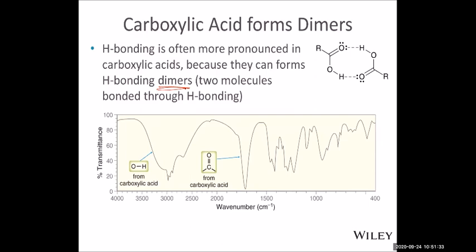And then still around 3000, we look at the other CH bond. Because the carbon is sp2 hybridized, the wave number is around 3000 to 3100. But since there's only one such bond, it should be fairly weak and sharp. So it is a weak band, W-K for weak. There should be only one tiny peak, a little spur.